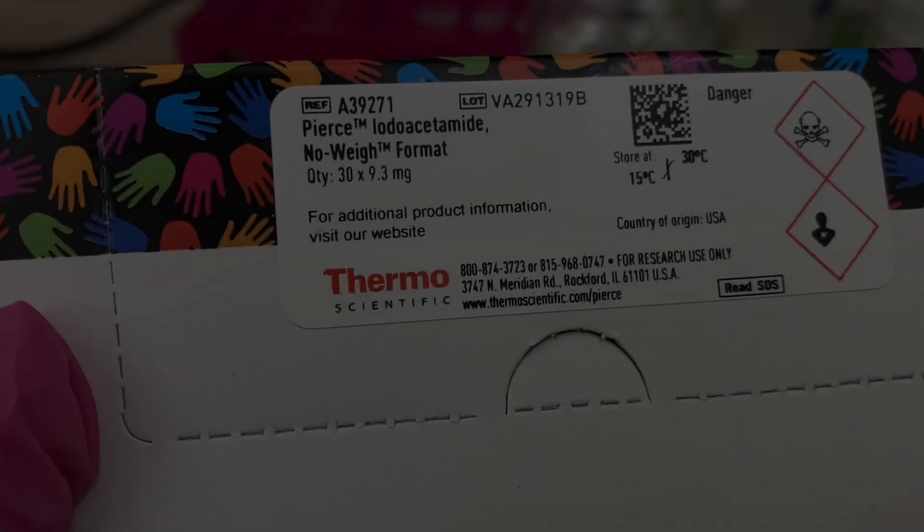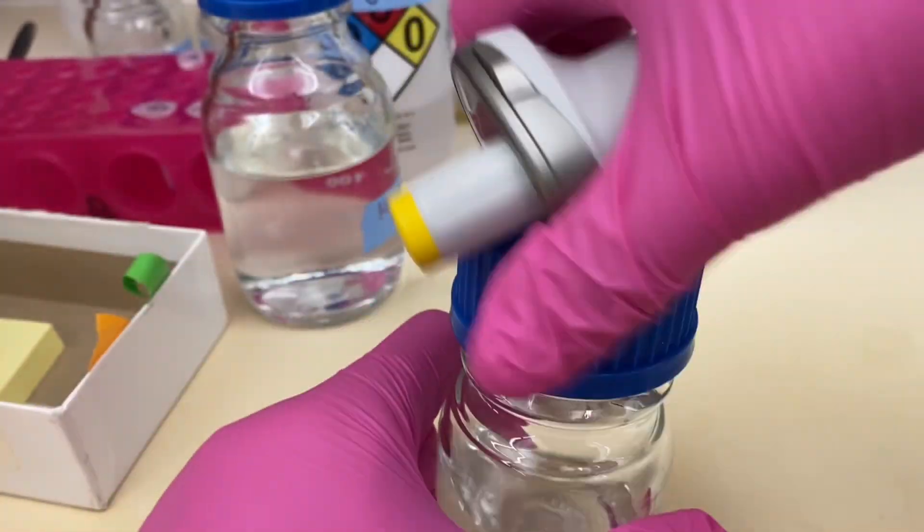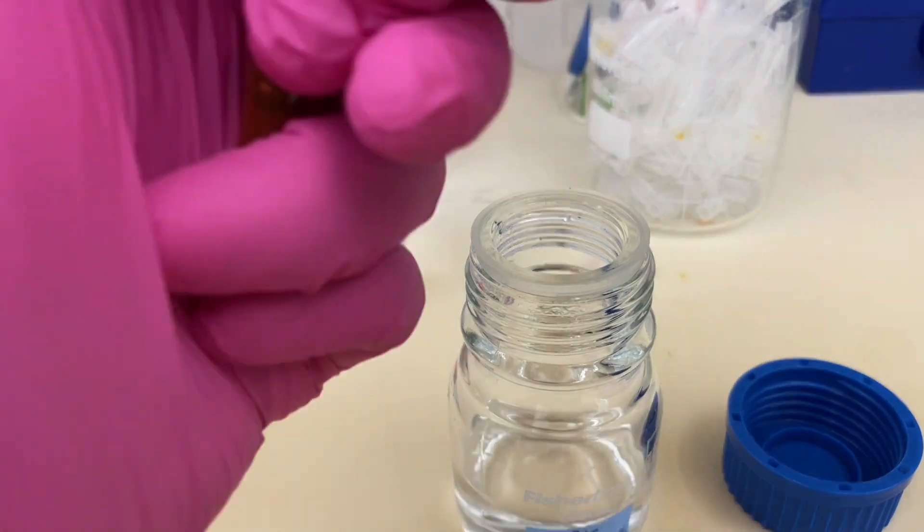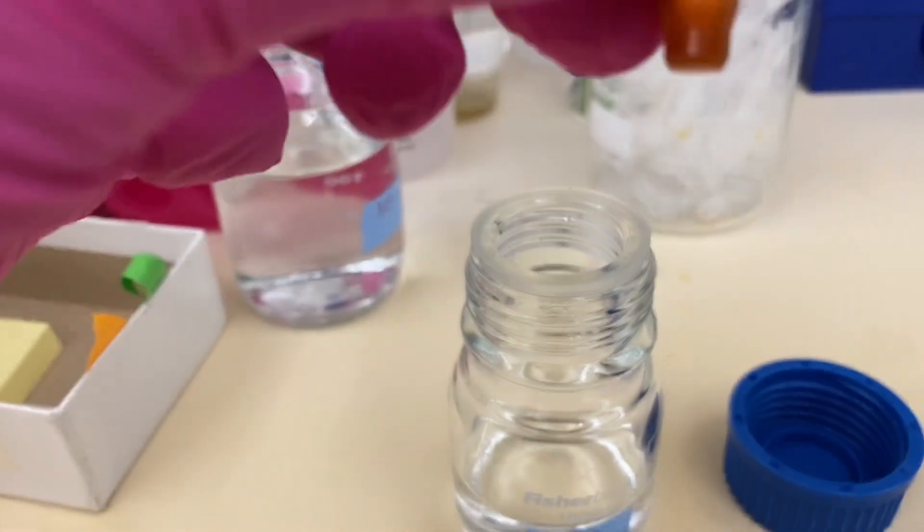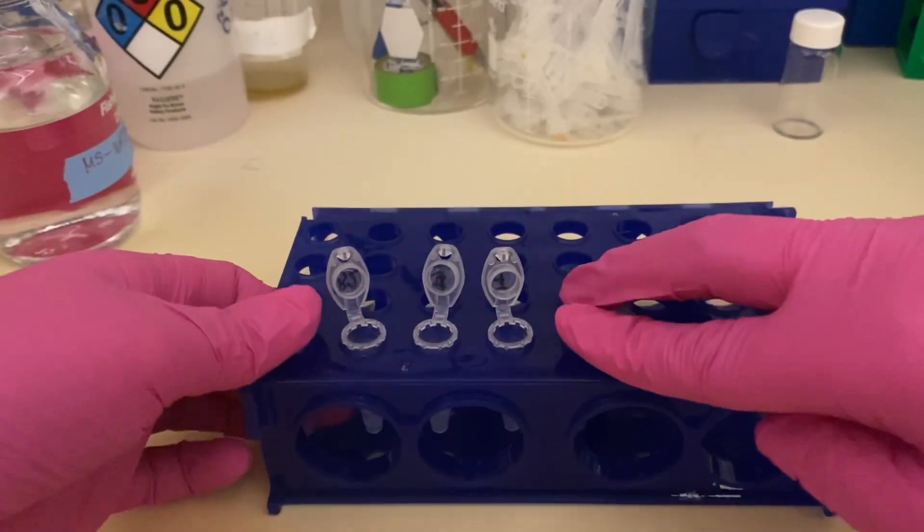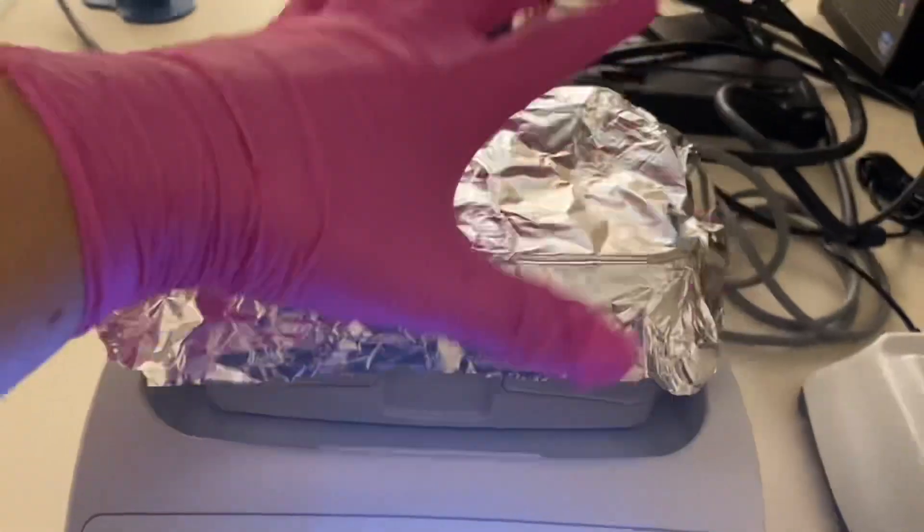The next step is alkylation as we want to lock those cysteine groups so the protein cannot form again disulfide bonds as they do tend to rebond sometimes. This step takes 20 minutes in the dark and I will be using iodoacetamide from Pierce. As you can see it comes in these little vials. I will make 375 millimolar iodoacetamide in ambic. I'm going to close all of my tubes now and then I'm going to shake them in the dark for 20 minutes. I'm going to cover my tubes with a foil. The shaking is at the room temperature.